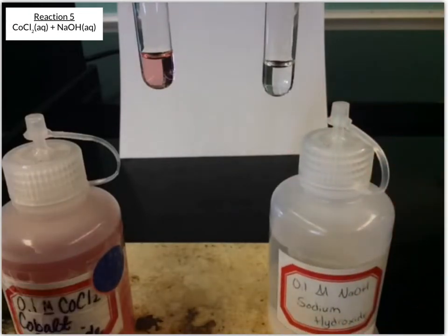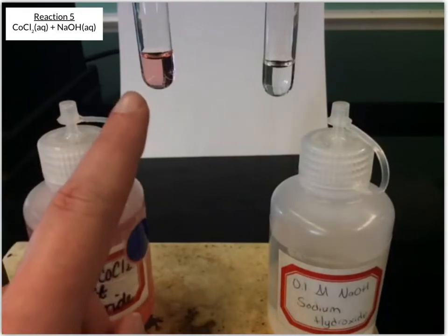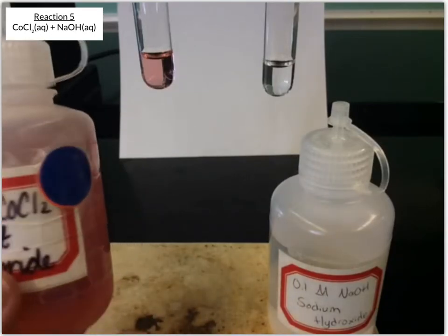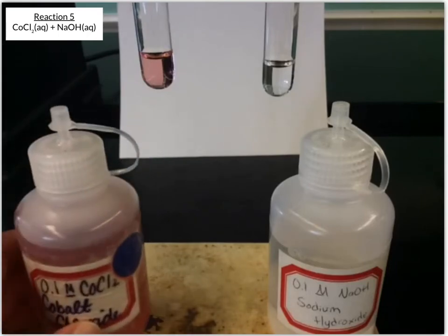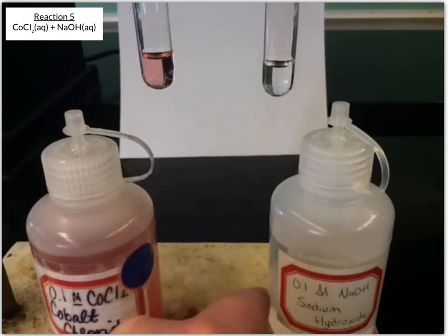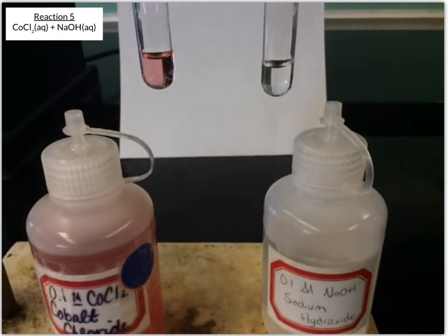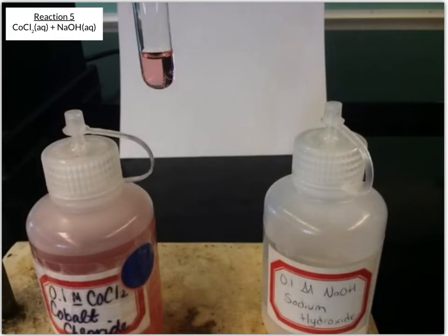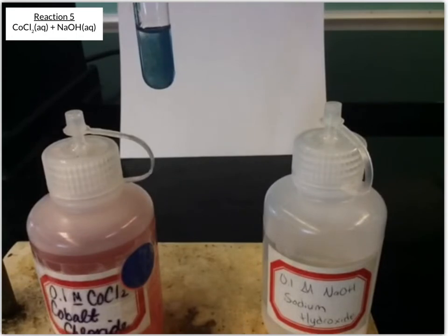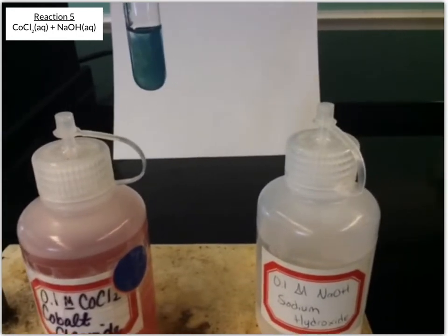Okay, and before I mix those, you should take note that the cobalt 2 chloride is a clear pink solution, or even when you look at the bottle, it seems almost red, but it's a clear pink. And then here we have a clear colorless solution for the sodium hydroxide. And I'll take that sodium hydroxide solution and pour it in the cobalt 2 chloride. And immediately you should have seen this change.